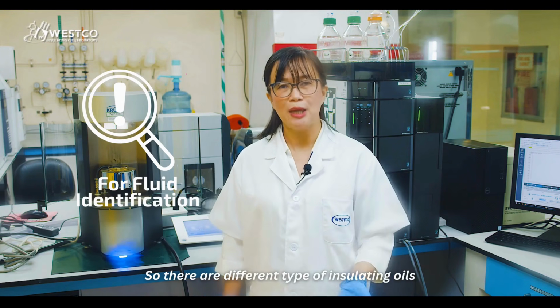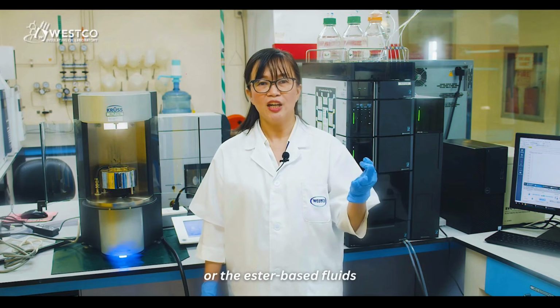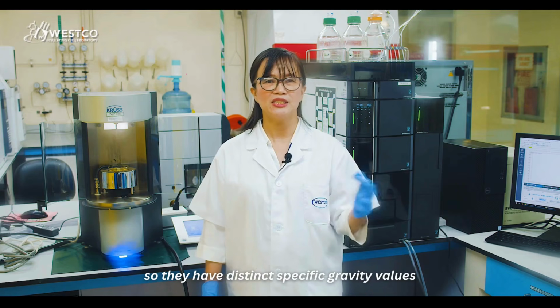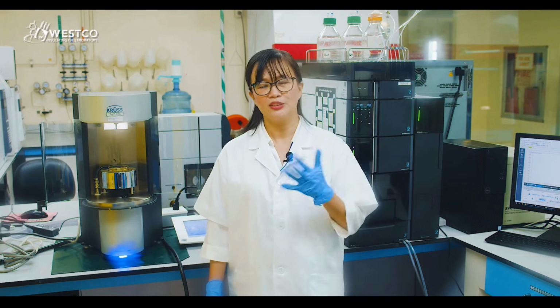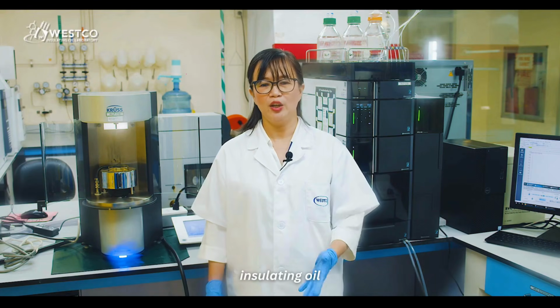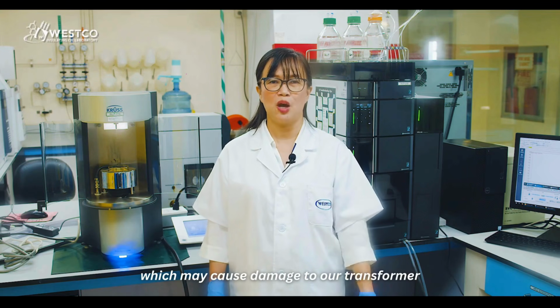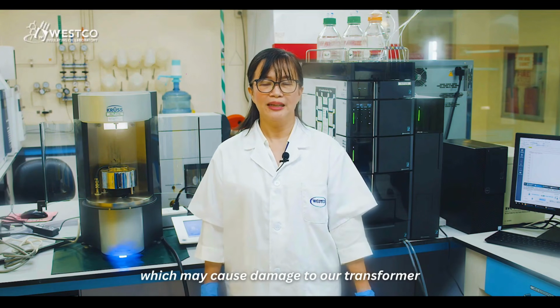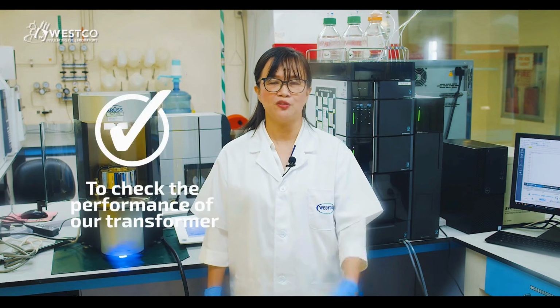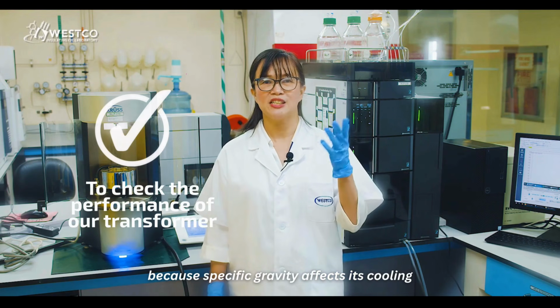The next reason, of course, is for fluid identification. So there are different types of insulating oils: mineral oil, silicone oil, or the ester-based fluids. They have distinct specific gravity values. Determining specific gravity will determine the type of insulating oil, which will avoid costly mix-ups which may cause damage to our transformer.